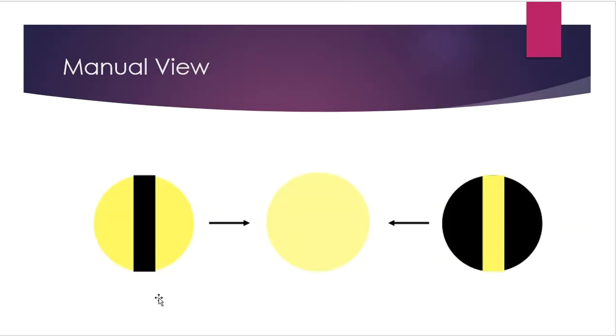Well, you would see one of two options here. Most of the time, people would see the light edges and a completely dark center. What this is doing is letting you know that, yes, your instrument is on. Yes, the light bulb actually works. The reason I know that is because light is coming through the outside edges here, and I see that. So that means my instrument is at least on, my bulb is working, and light is coming through. So it's really just a confirmation thing. And then in the center is typically where this dark area would be located.